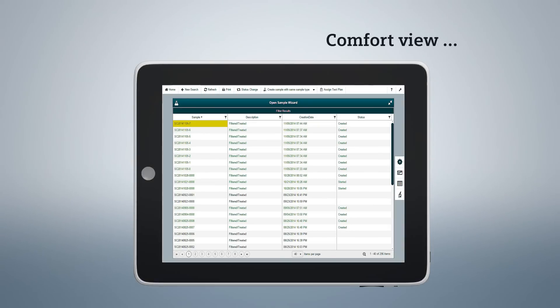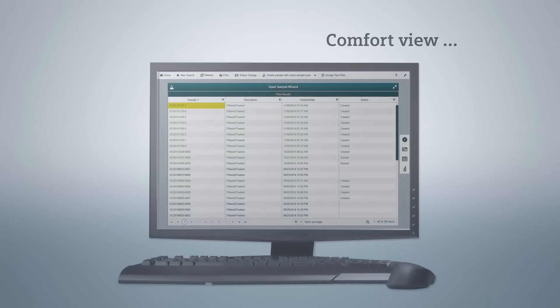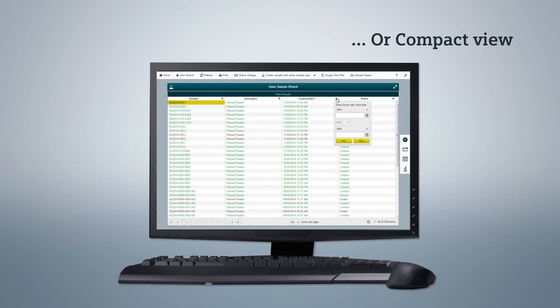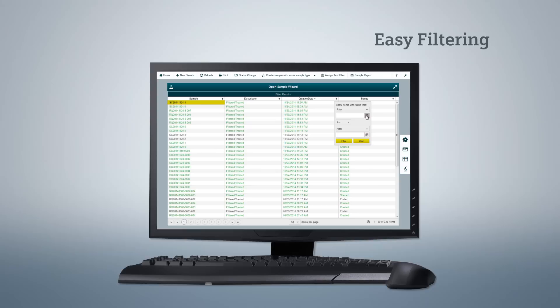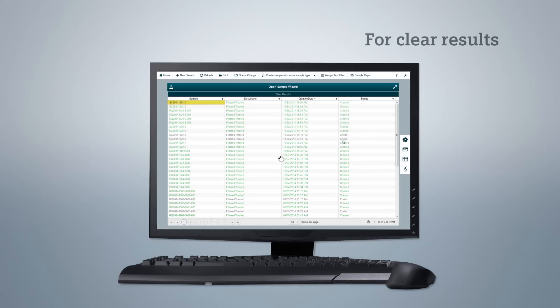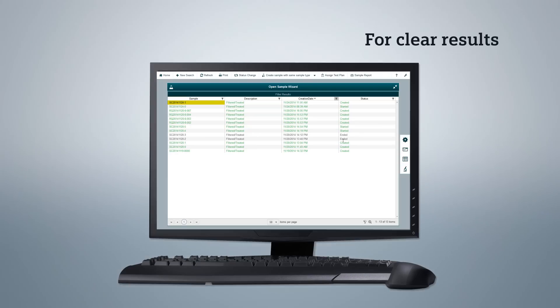Choose the view that best suits your needs or the device you are using. You can apply intuitive filters to the results lists to display only and exactly what you need to see.